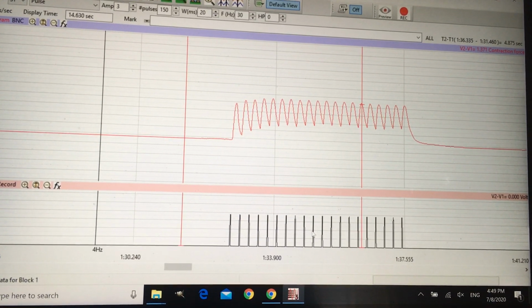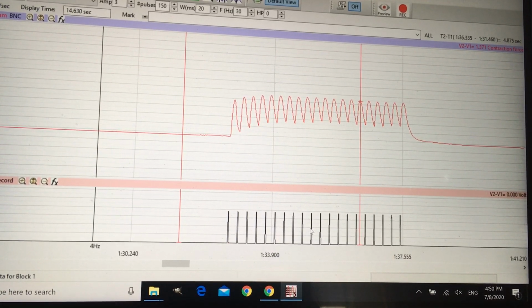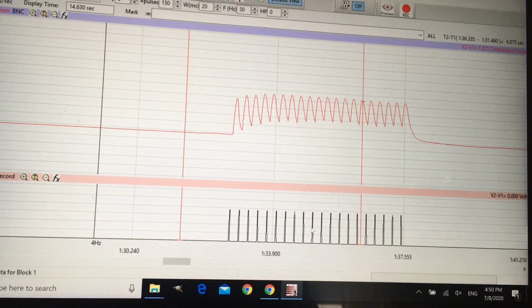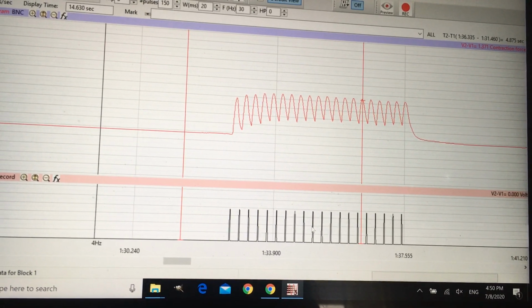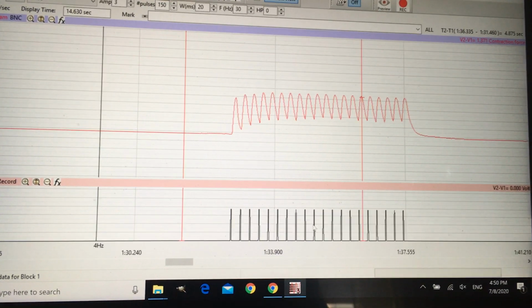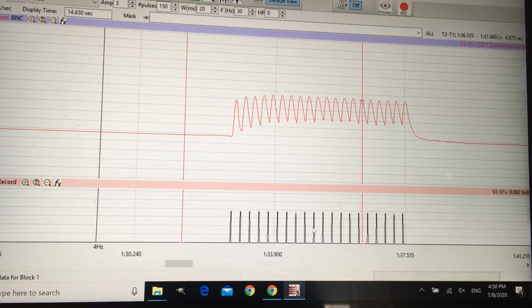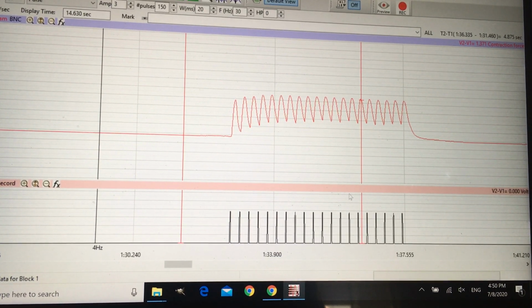Another thing is there's a question 6, figure 6 on the lab report, which asks you to generate a graph to show the relationship between the contraction force and the stimulation frequency. For that one, we have to analyze the force due to summation, right? Let me show you what we can analyze.